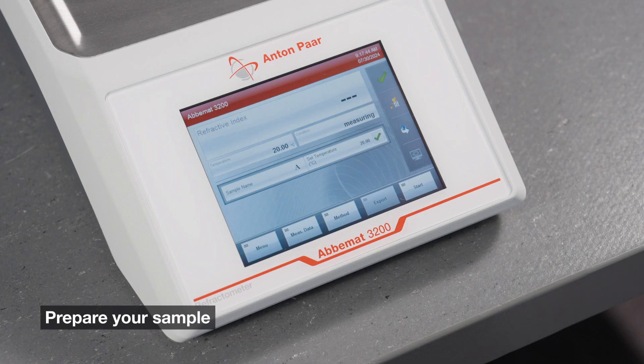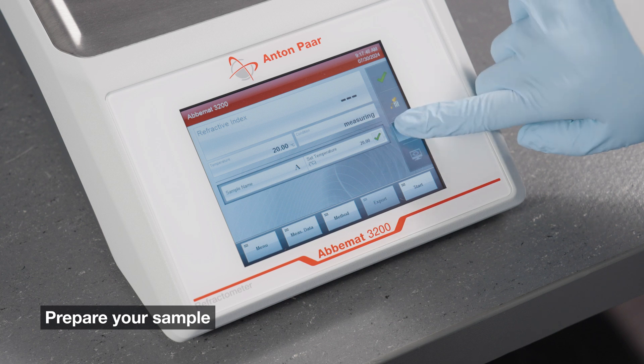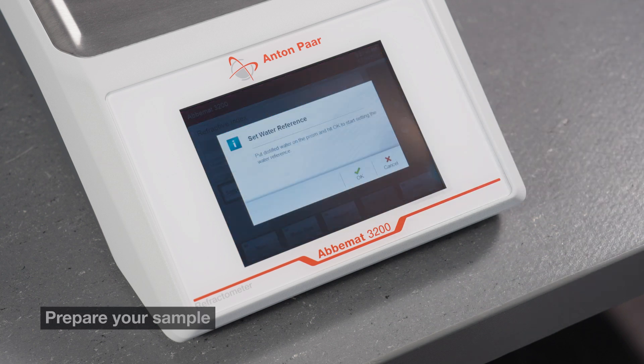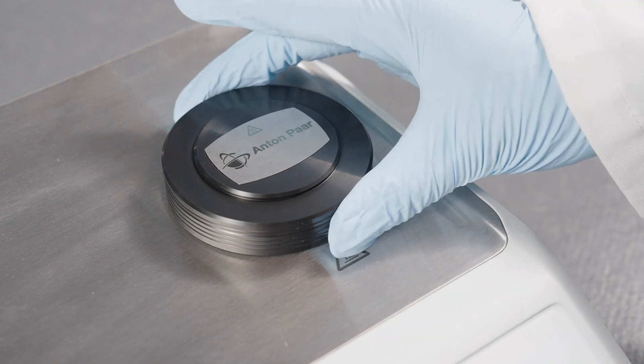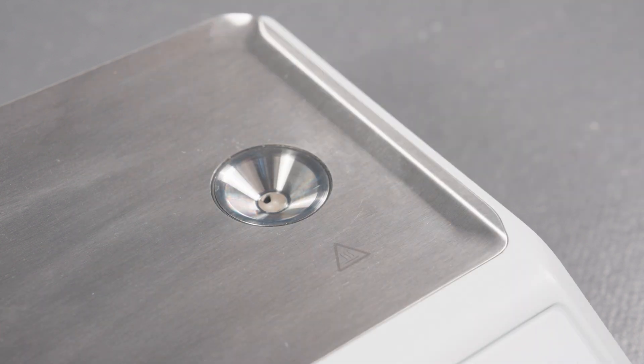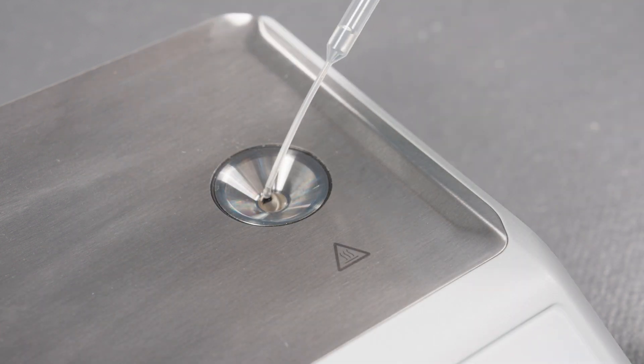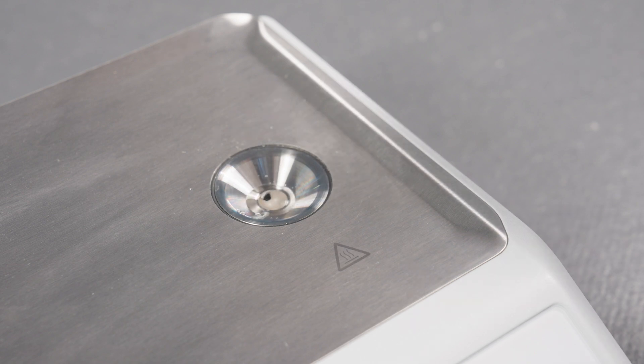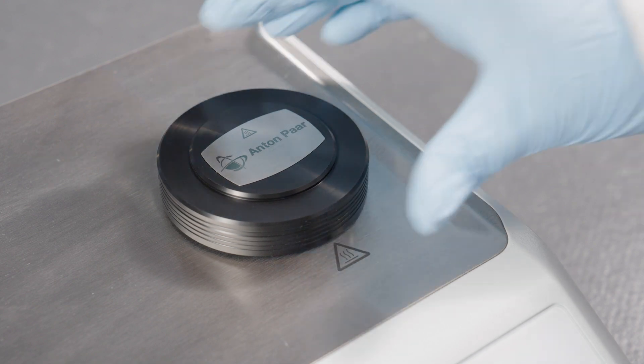Adjust using UltraPure water for accurate results. Tap the adjustment icon, follow on-screen instructions, and ensure the sample is homogeneous and free of bubbles. Use a pipette to apply at least one milliliter of UltraPure water to cover the prism completely. Place the magnetic sample cover over the sample.